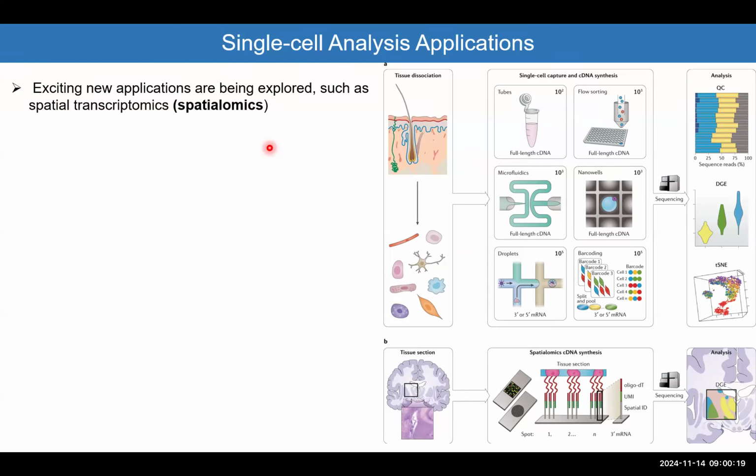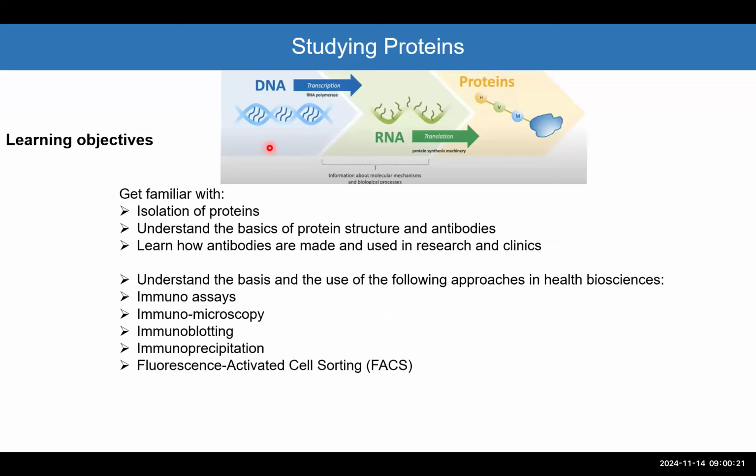And with this, we are closing the chapter of the RNA-seq, and we will move to studying proteins. Now, to prepare you for studying the proteins, there will be 3 or 4 lectures about how we isolate the protein, how we analyze the protein, and what are the major techniques that we use. And then we will move to describe 4 or 5 applications, like when you go to do a blood test or a urine test, and all these things are in principle detecting certain proteins.